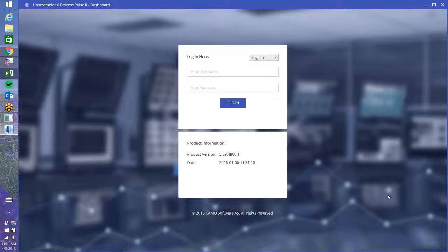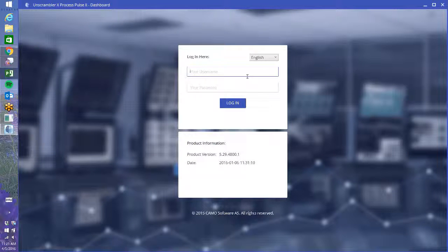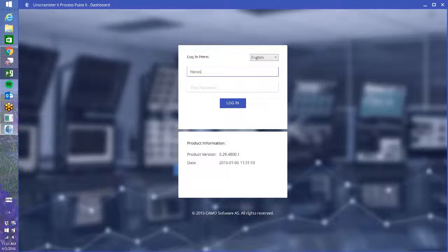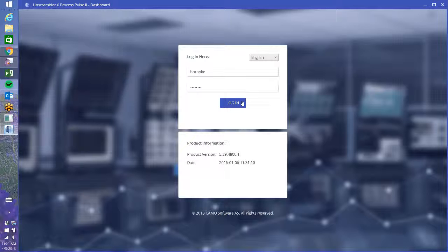I am going to show today a quick demo of Process Pulse 2, just some of the high level features, how to set up a configuration so that you can monitor your process. The first thing we have to do is log in, and you can set different levels for your people who are logging into this account.